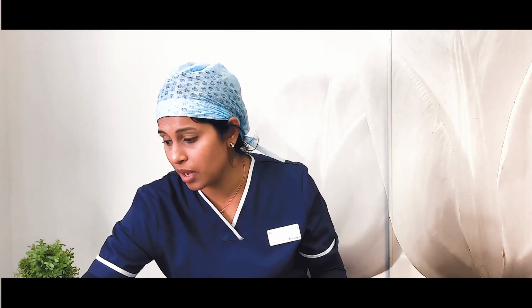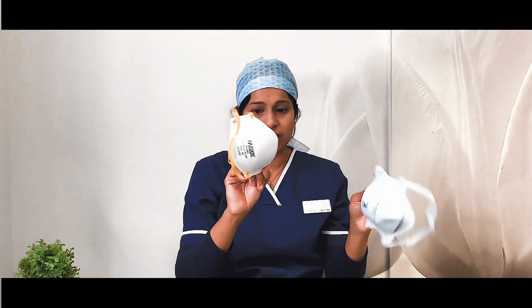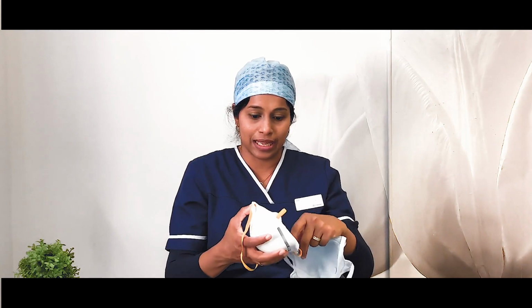The other types of the N95 masks can be, like I explained, cup shaped. Again, it's very similar. These are the ones that go around the crown of the head.